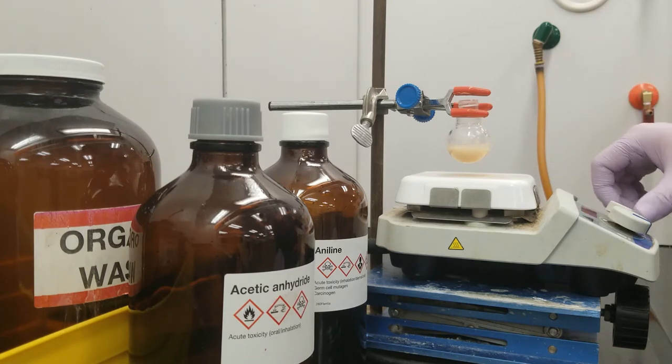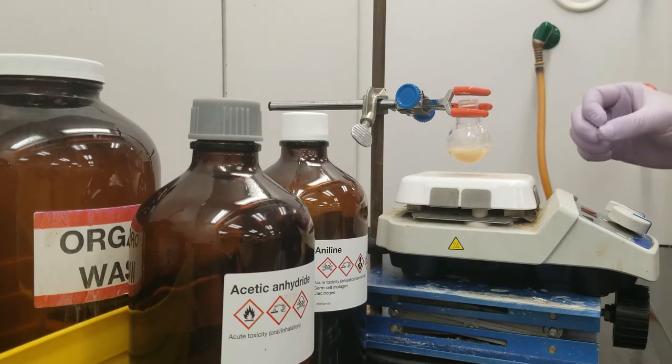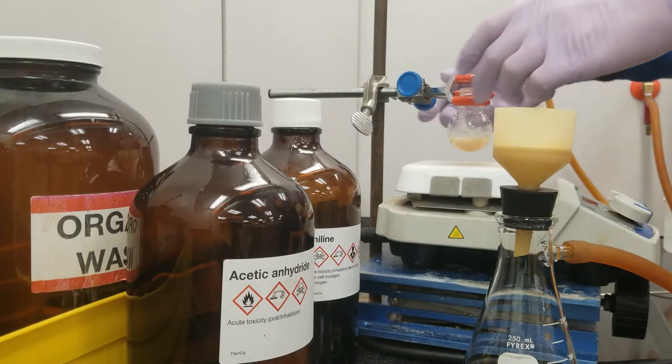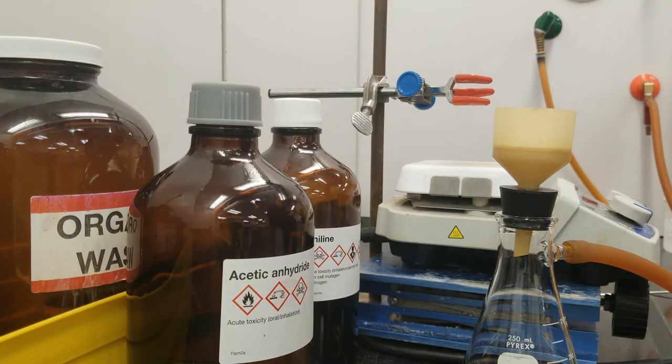After we've added all of our acetic anhydride, we are going to stop the stirring and just let it stand for a few more minutes. I can tell from the solid that's already appeared that the reaction has mostly already gone to completion. But we want to get a nice high yield, so we're going to let this stand and finish itself off, then come back to do the workup and recrystallize it to remove some impurities introduced by this old aniline. So five minutes have passed since the acetic anhydride was done being added, and we have our chunky, off-white, tan-colored solid here.